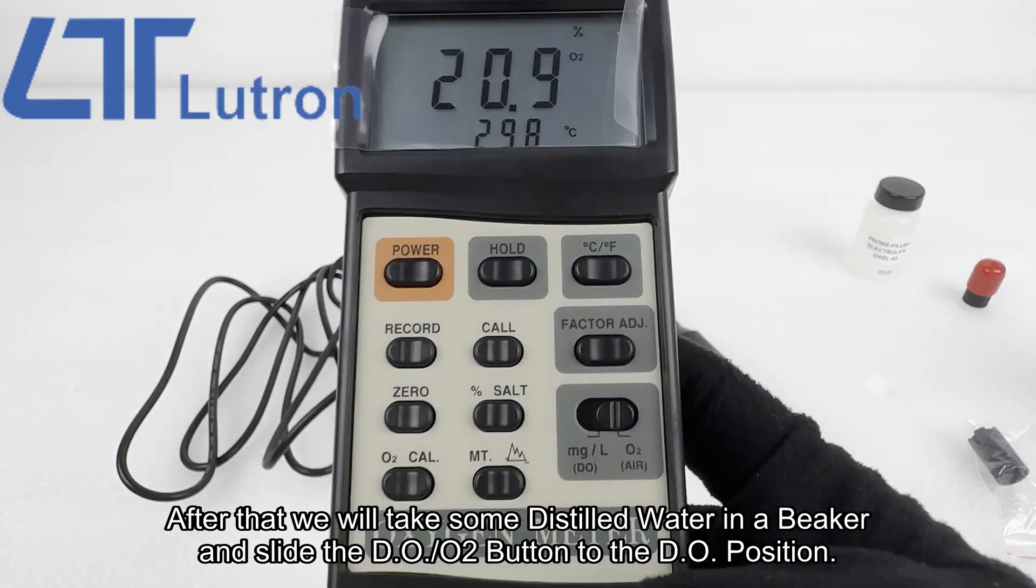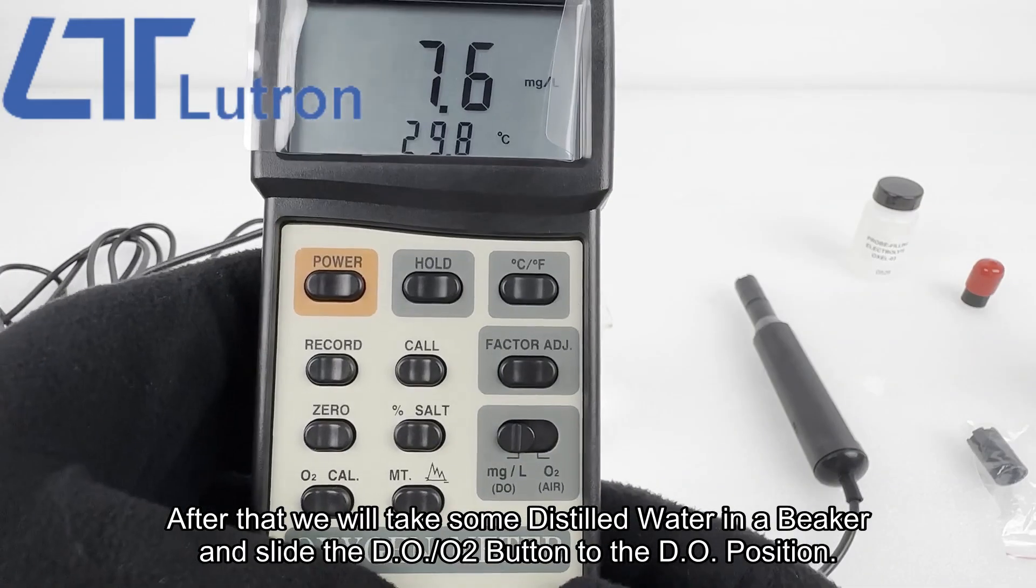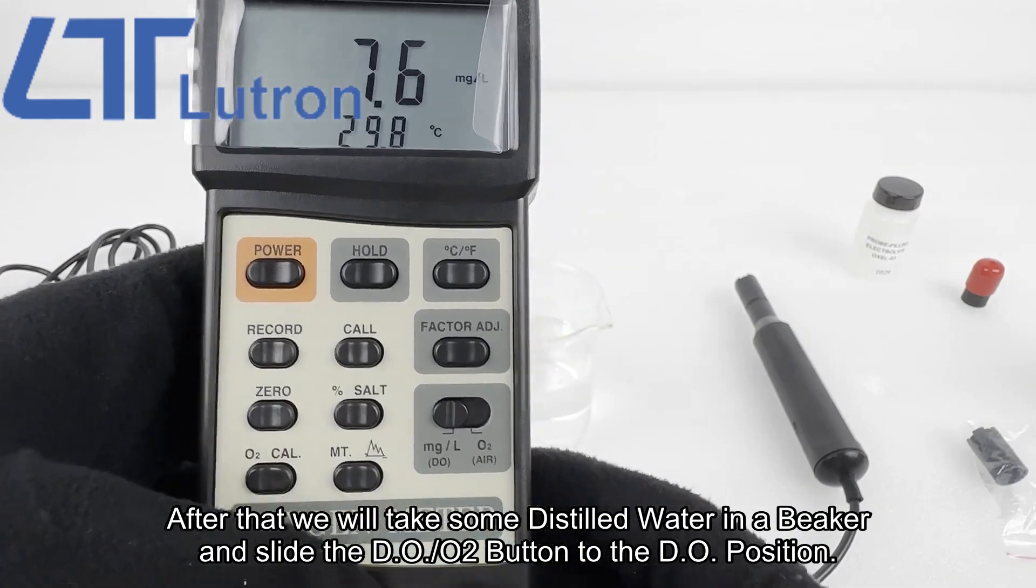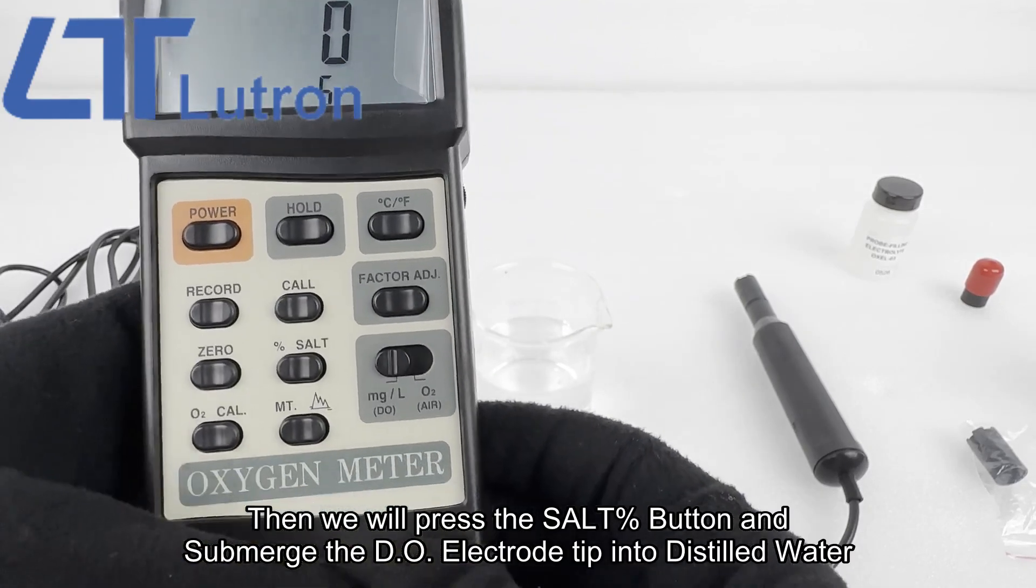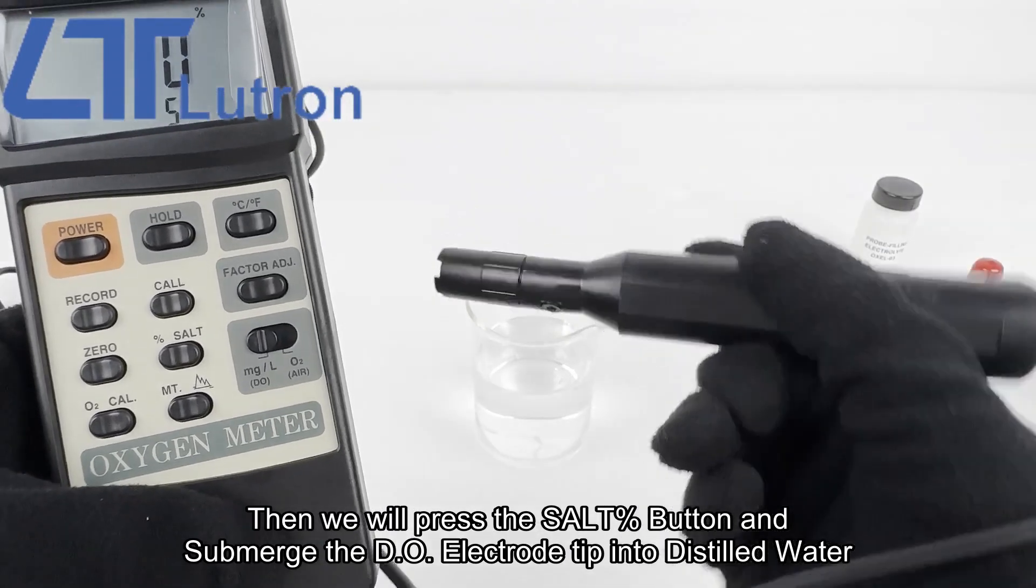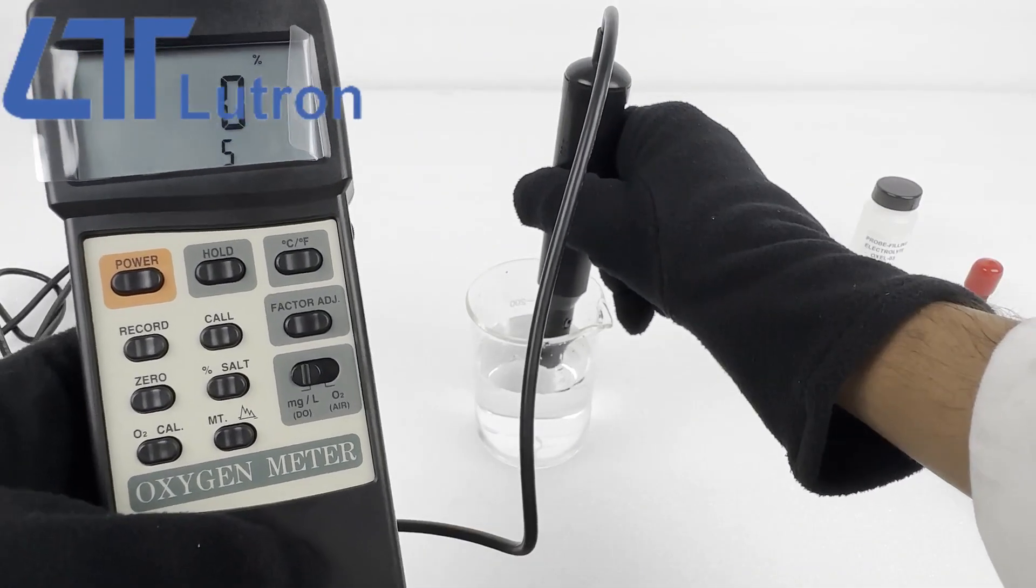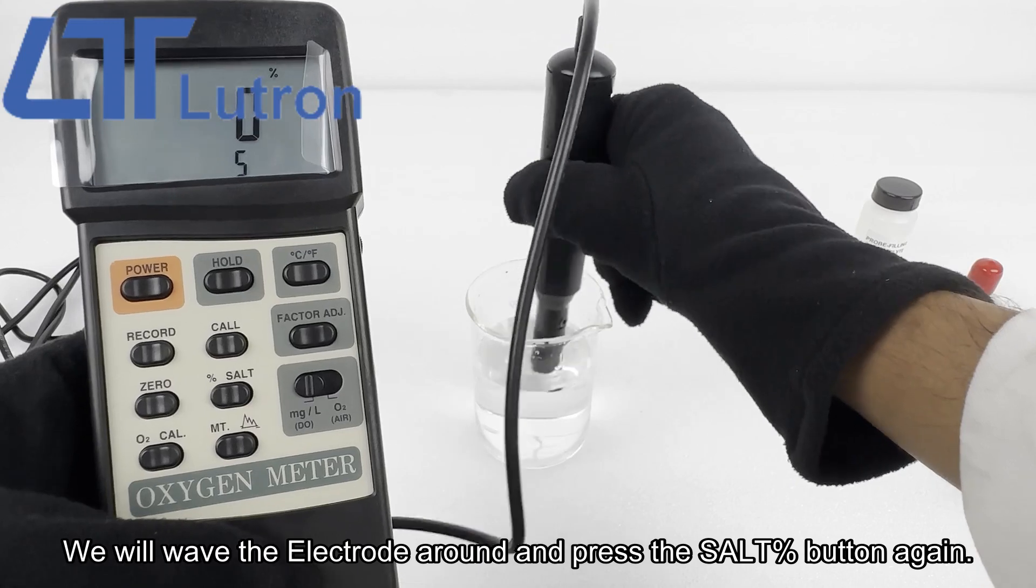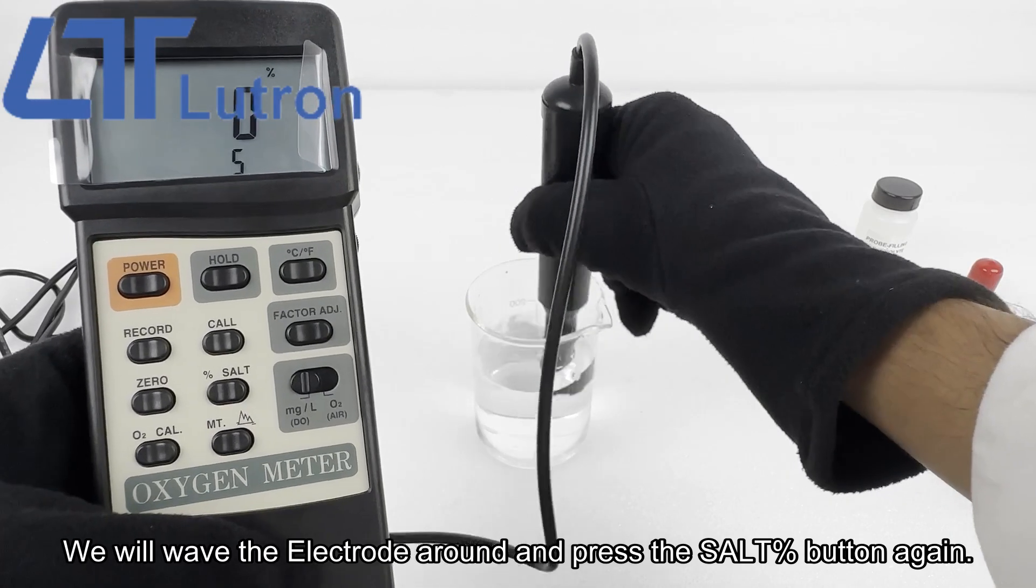After that, we will take some distilled water in a beaker and slide the DO O2 button to the DO position. Then we will press the salt percent button and submerge the DO electrode tip into distilled water. We will wave the electrode around and press the salt percent button again.